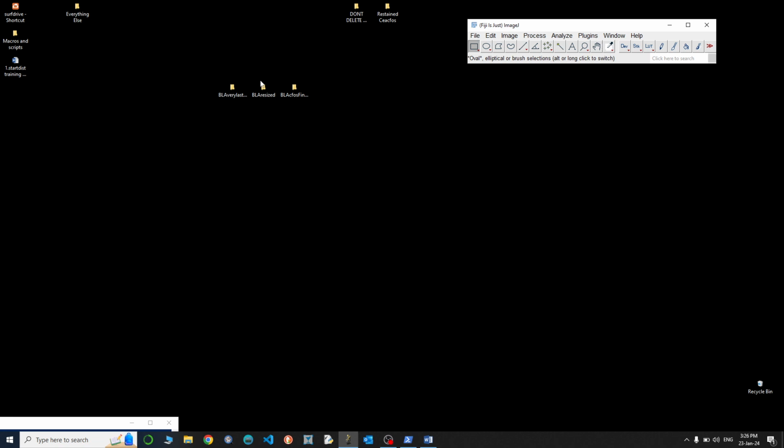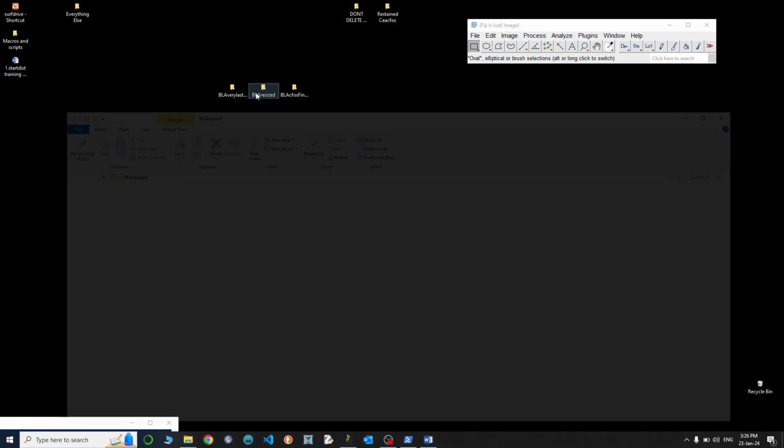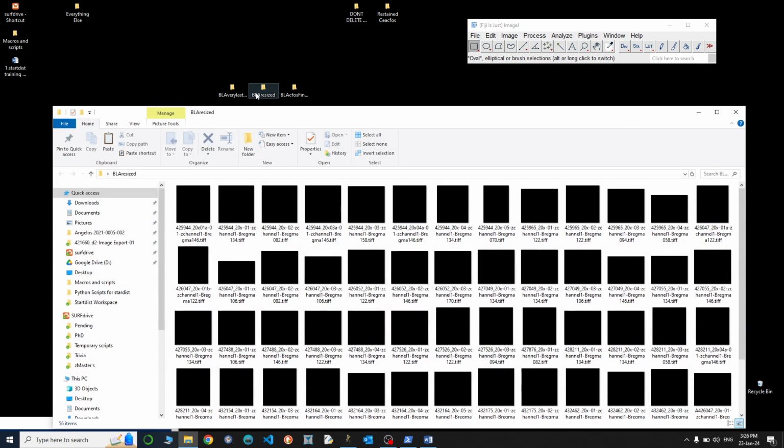So from now on, when we're getting measurements, since we have our final regions of interest, we just need the BLA resized images. And this, in this set of tutorials that I made, is actually the first step, which was step number 12, if I'm not mistaken, or 13. Just after training the network, you remember that we first resized our images before we create the white background. So this resize step is what we have here.